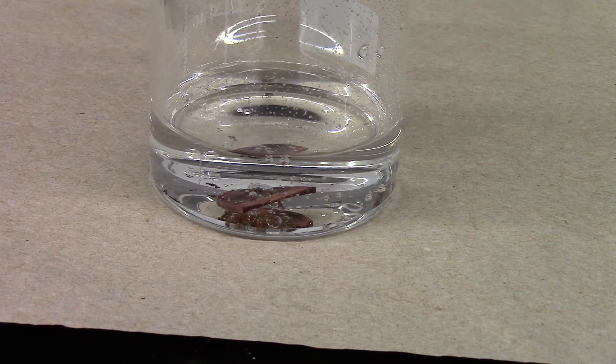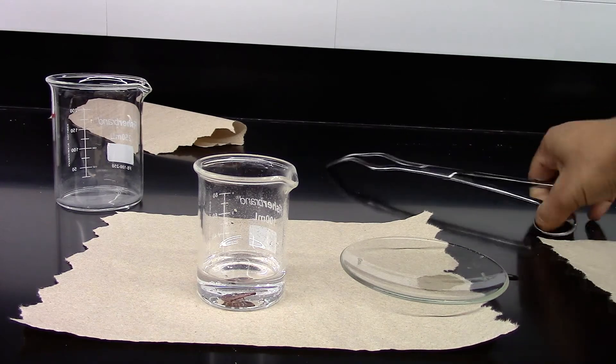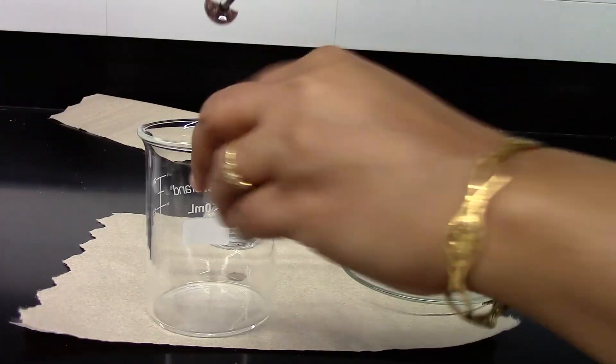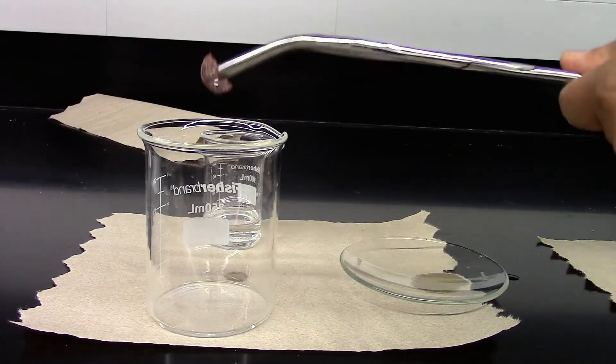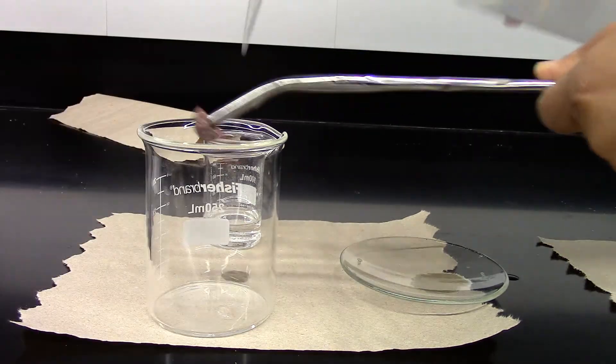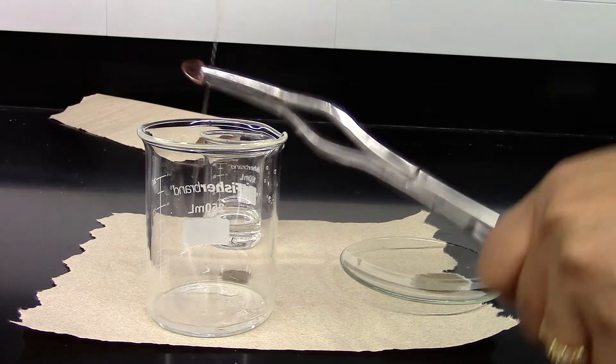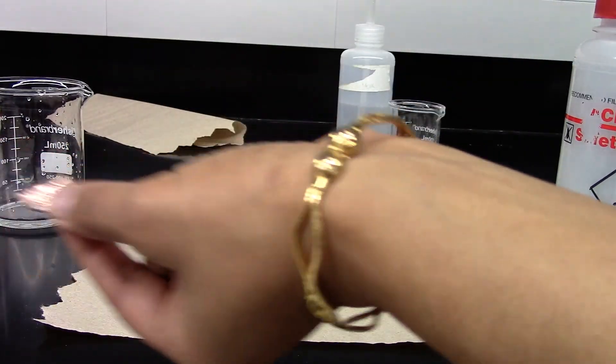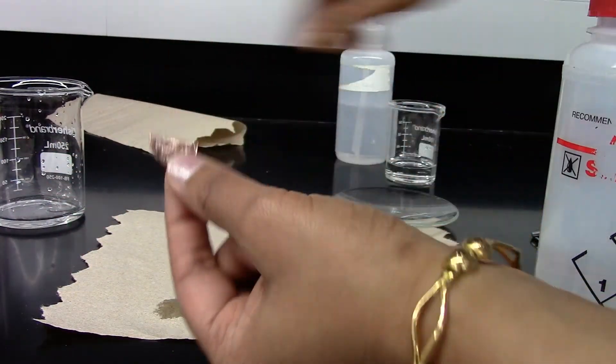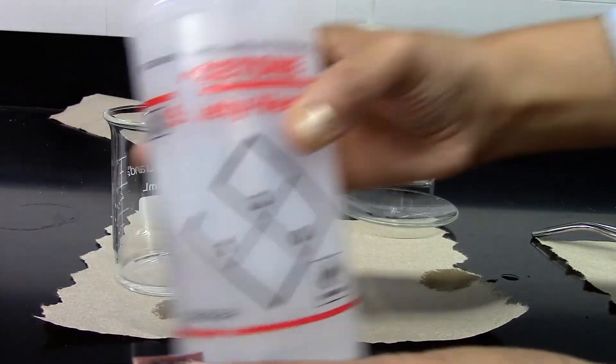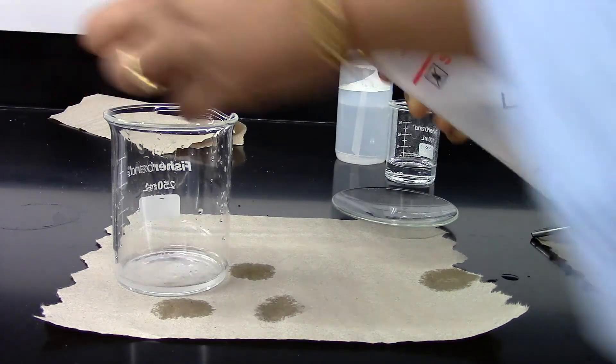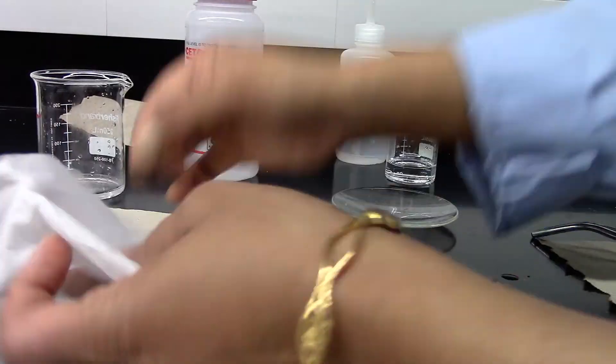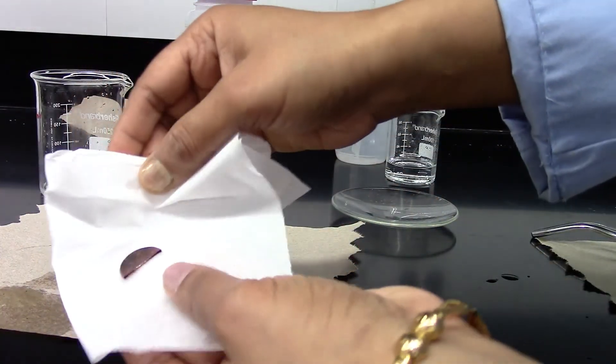Clean it, dry it, and get the mass. I'm going to take out the coin with a tong or tweezers. And I'm going to rinse it with some DI water from the wash bottle. So now it's safe to hold because it's already rinsed out. I'm going to rinse it with some acetone.